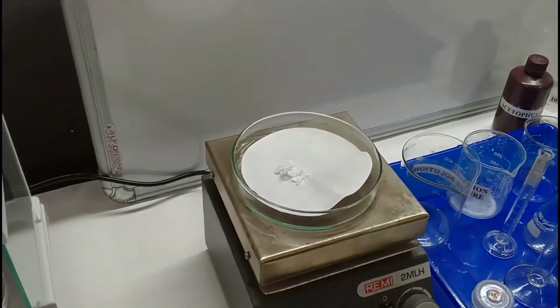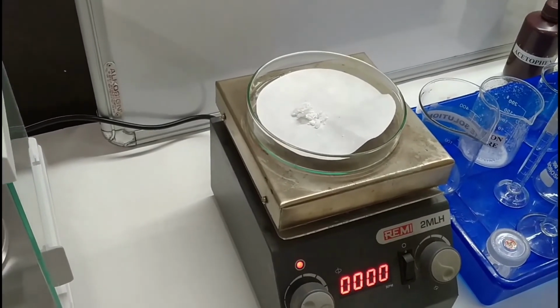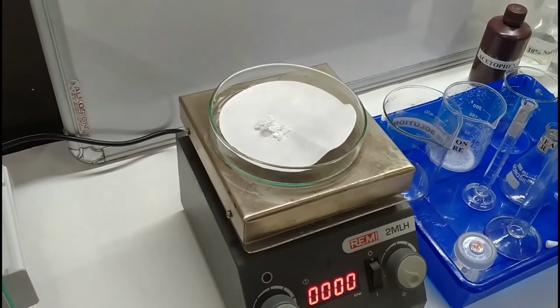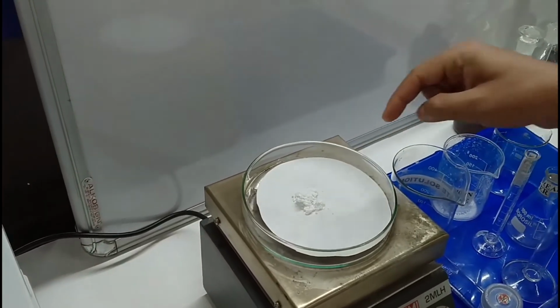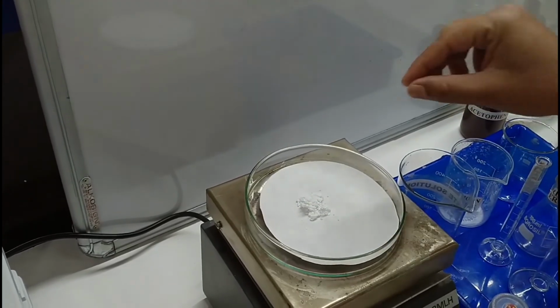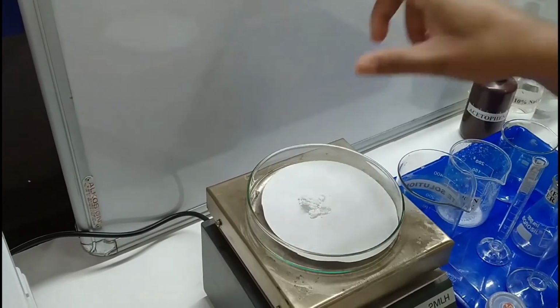Let it dry for a while, and then we are going to measure the weight of the prepared benzoic acid. Now you can see it is almost dry, so we remove this from the hot plate.